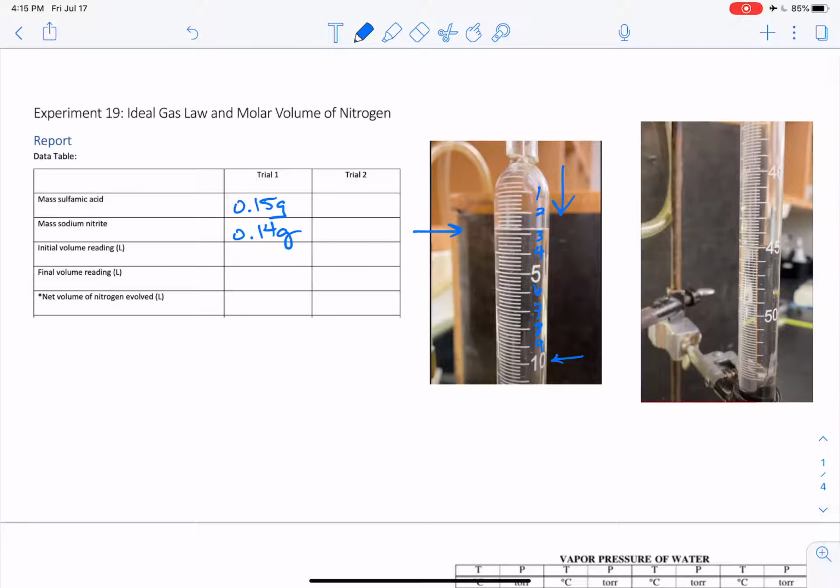So say we call it 2.8 milliliters because the procedure told us to record it to the tenths place, which is where the 8 is. And then you guys are going to convert it to liters. So you should know how to convert from milliliters to liters. Now, again, don't take my word for it. You guys read the burette and get your own reading off of it.